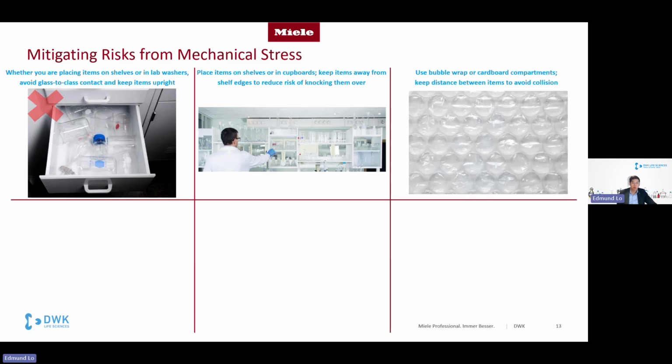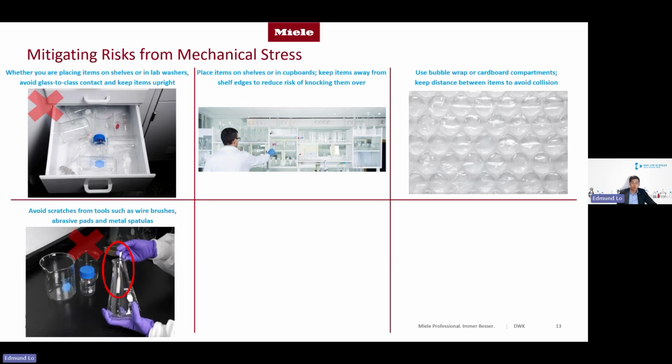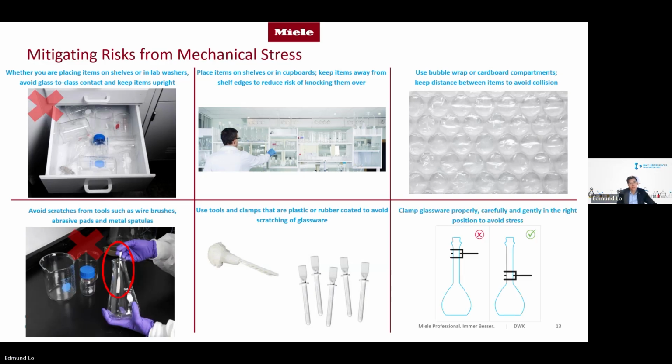Use bubble wrap or cardboard compartments, especially when transporting glassware from one place to another. Avoid scratches from tools such as wire brushes, abrasive pads, and metal spatulas.